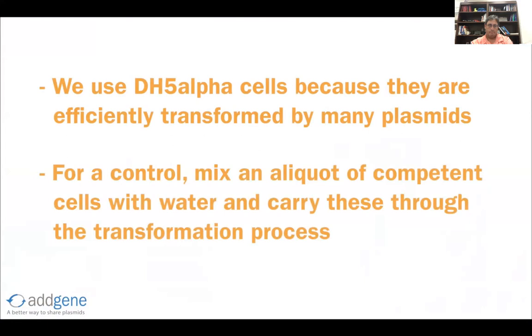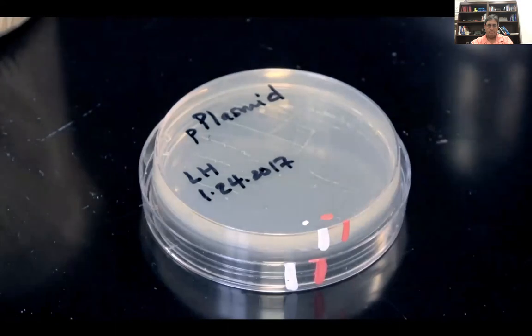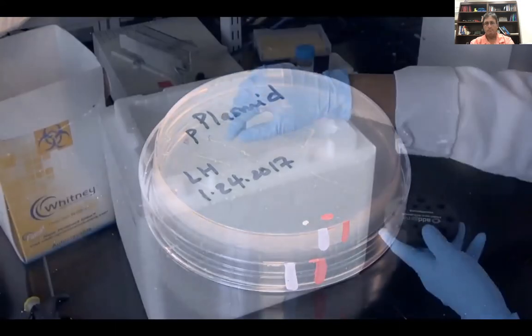These cells should not grow once plated, but will give you confidence that your antibiotic works properly. Be sure to carefully label your samples and controls so you don't confuse them along the way.